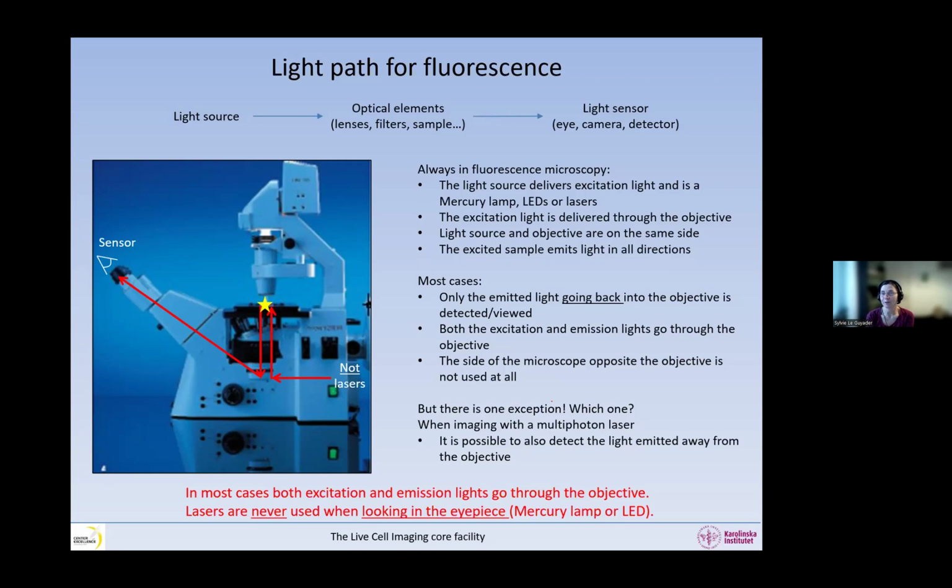And then you have lasers, of course, right? Yes. On the single point confocal, we usually have 3 types of light. We use the lasers when we want to image anything, transmitted light or fluorescence. When we want to look in the eyepiece, we need a halogen lamp because we cannot use the lasers, and we also need an LED, for example, to look in the eyepiece at fluorescence. So on the single point confocal, we use a different light source if we look in the eyepiece or if we image.